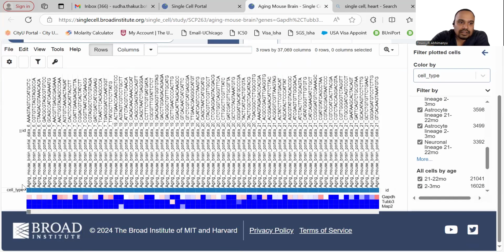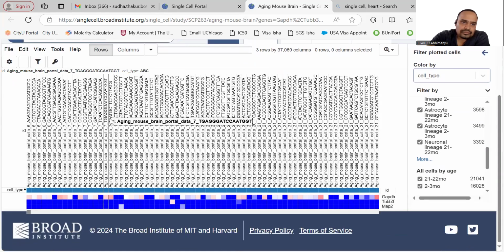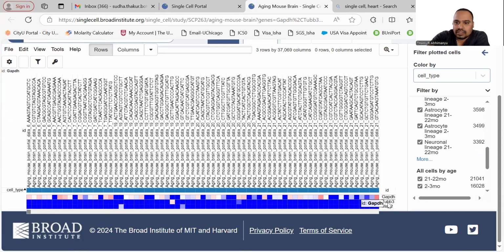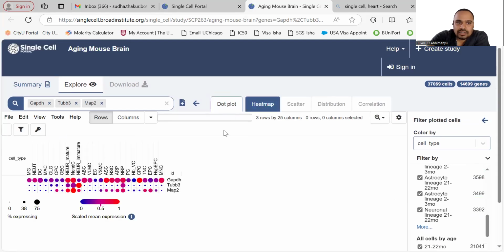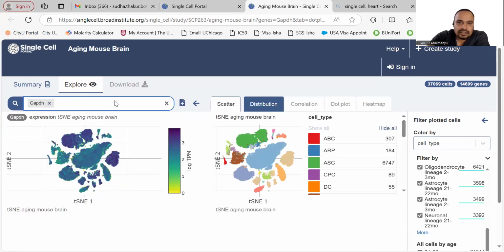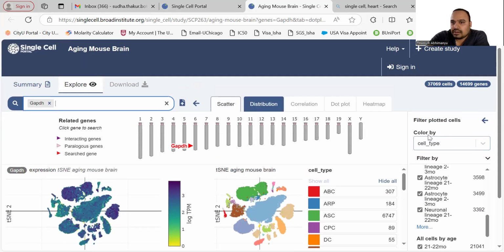You will find individual subject and individual sample based expression. So this shows different proteins. This is how you can easily examine and plot the expression of certain genes. This tells you the cell type specific expression of any particular target genes.